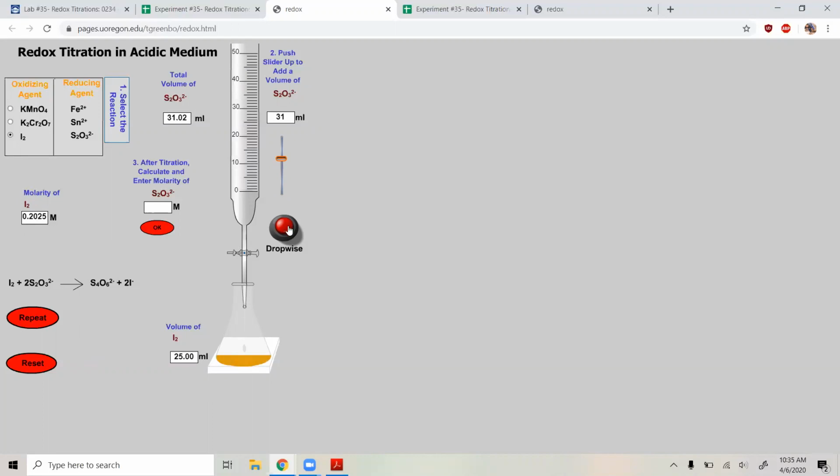And then from there, now I can go in a little bit slower to do my titration. So maybe I'm still going a little bit fast because we're still a little bit far away. All right, so I know it's not 32. I think that this one's useful in that it does have you practice your titrations, and it will go through on a single drop, 32.6 on this one. So a lot better than that 34.